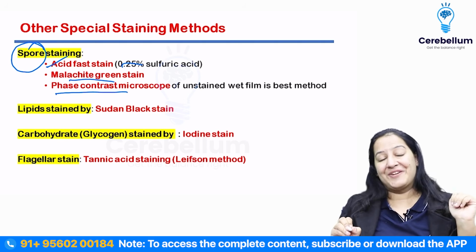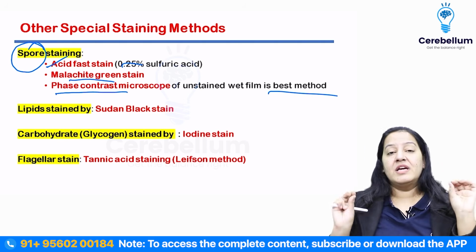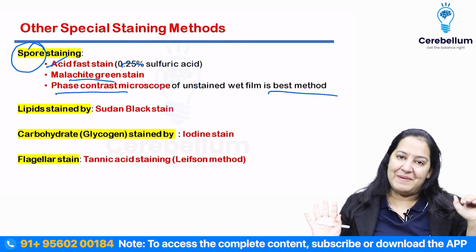One of the types of the microscope. A phase contrast microscope. It is the best method. I must say it is the best method.